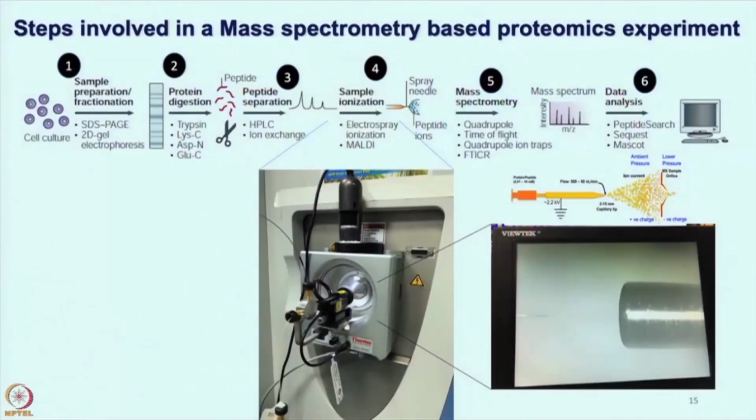Now, you are familiar with liquid chromatography and how nano LC can be used, how different parameters and different pumps are important, and that keeping a watch on the pressure is very crucial. Now, you are ready for injection with the electrospray ionization. This is the very crucial part, because now all your peptides have been converted to gaseous ionized forms and they have to move inside the mass analyzer for further analysis. So, various settings, and again the voltage, are important criteria.